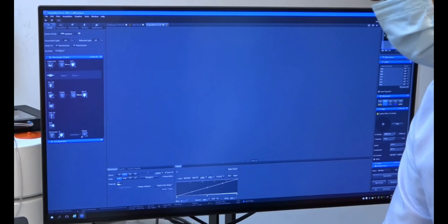As we can see here, the intensity can be totally controlled through the software. See here, light is coming onto the fluorescence filter turret, but it is not going ahead of it. From the filter turret, based on what I want to see, depending on different bandwidth or the excitation and emission composition, the filters have been given. For example, if I want to excite in the UV range and want to have an emission in the blue range, I will use a DAPI filter.